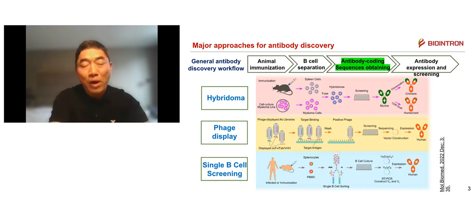But while making hybridoma, it's certainly true that we lose plenty of, in many cases most of, the B cells. Say only 10% of B cells survive, so you can only get the best antibodies from the only 10% left. Also, the hybridoma solution is time-consuming and causes much labor work.